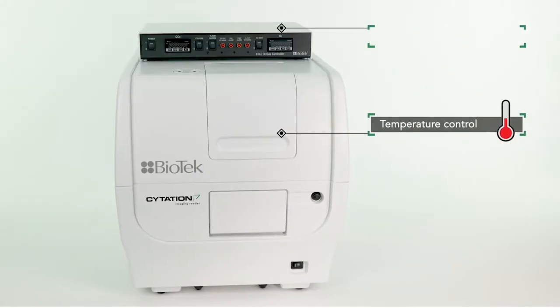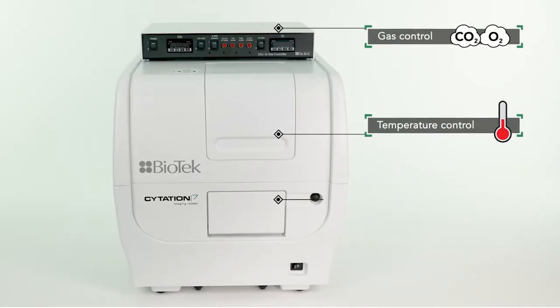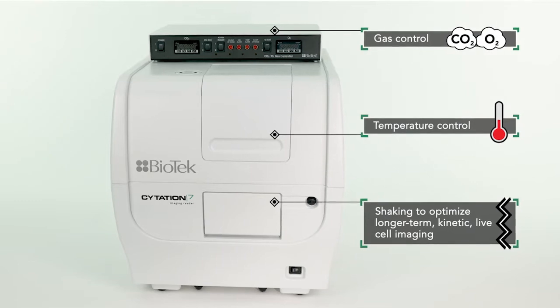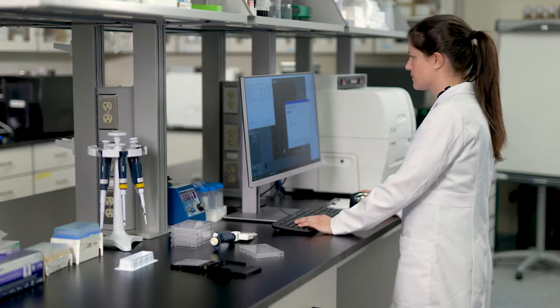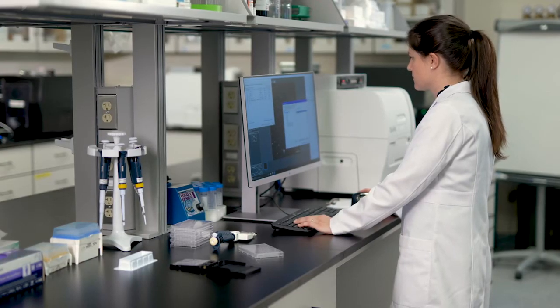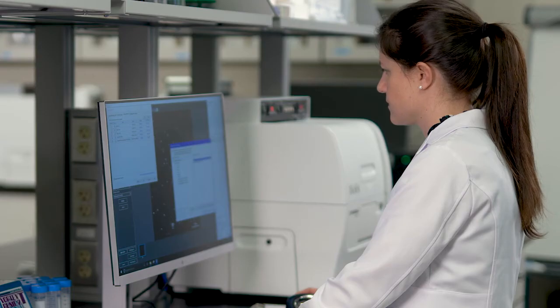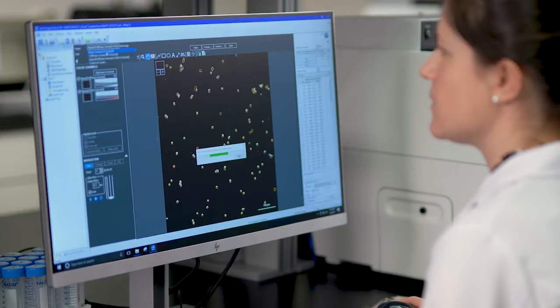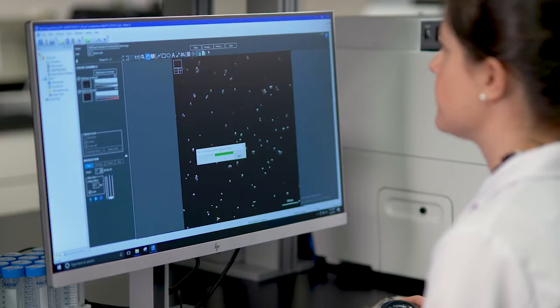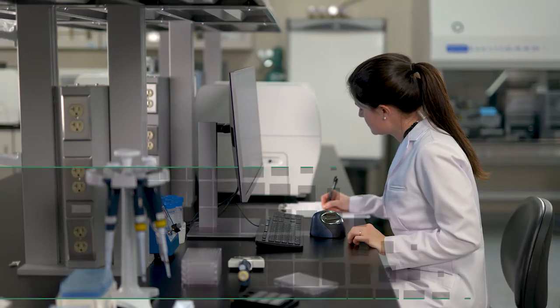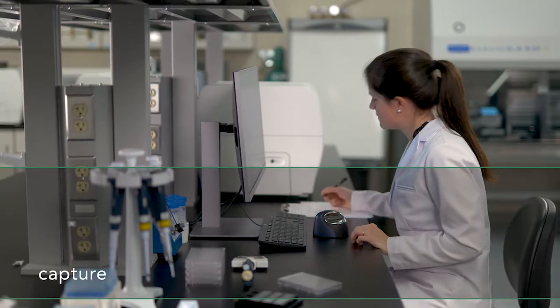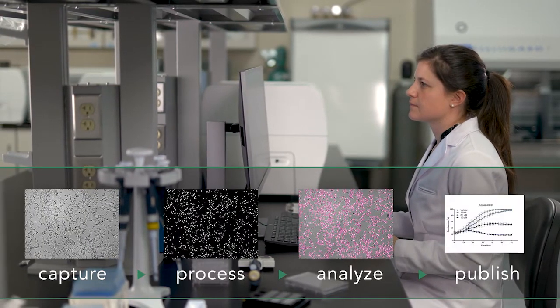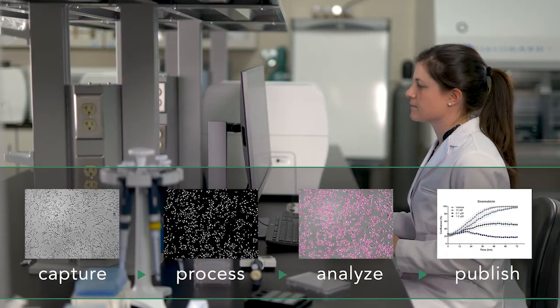Citation's temperature control, gas control, and shaking provide the ideal environment for kinetic live cell imaging. Citation and Biotek's Gen5 software work together seamlessly to create a unique, user-friendly microscopy experience, with automated imaging capture and powerful image processing and analysis, all in a single, compact system.